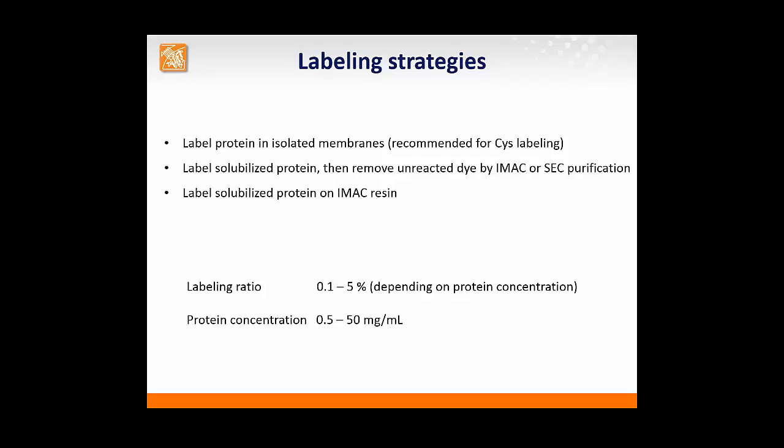When your protein becomes more stable, you can concentrate it, or you have fairly large quantities of the protein. It's preferable to concentrate it to at least 10 milligrams per mil or higher. And in that case, you will be doing your FRAP experiment at conditions closely resembling the crystallization conditions. Another benefit is that you might detect some initial very tiny crystallization hits already in the LCP FRAP assays. And of course, since your protein is labeled, this detection is very easy using fluorescence imaging.